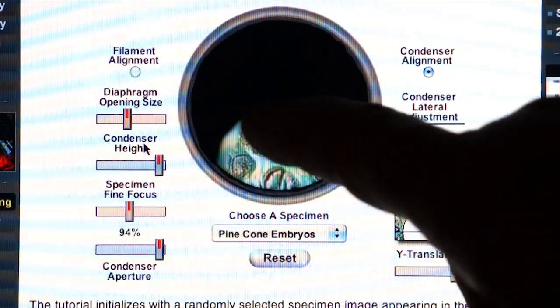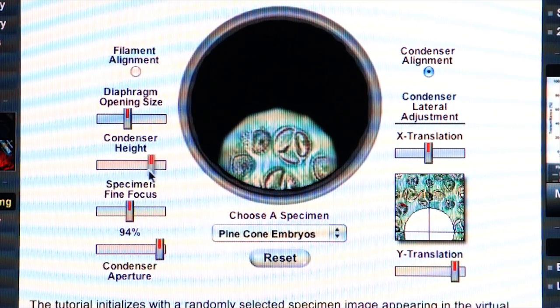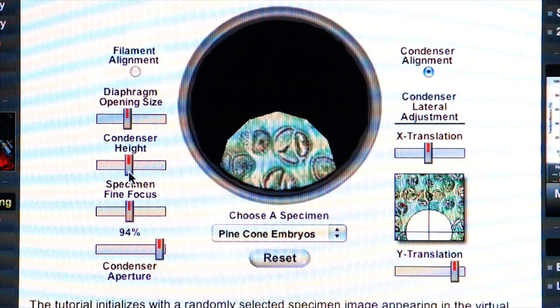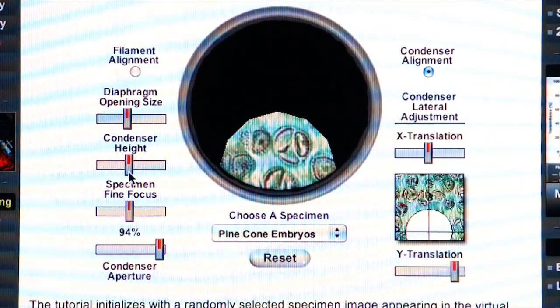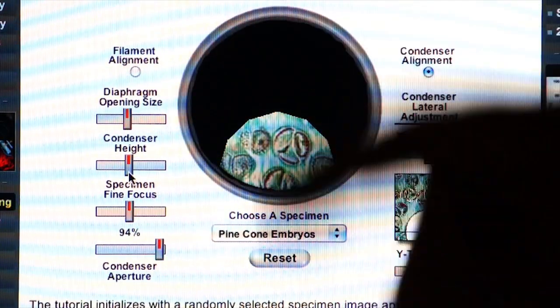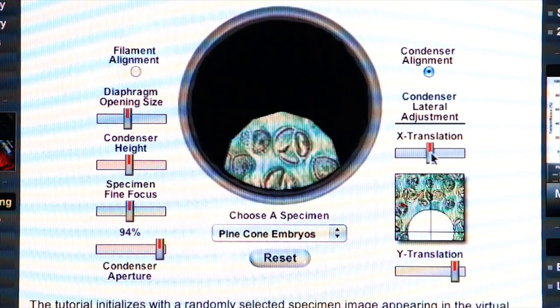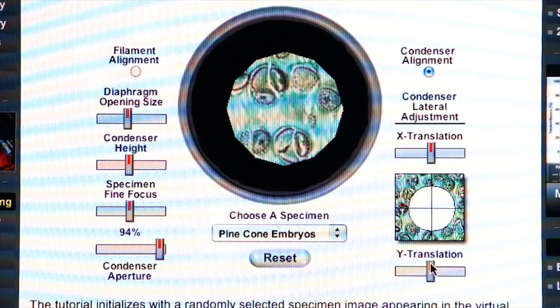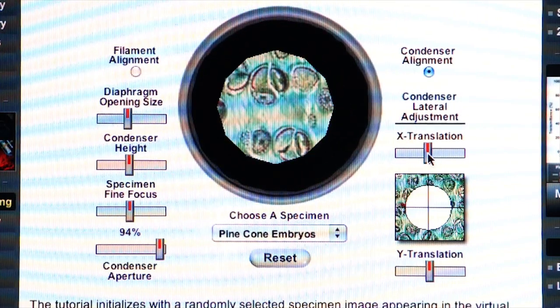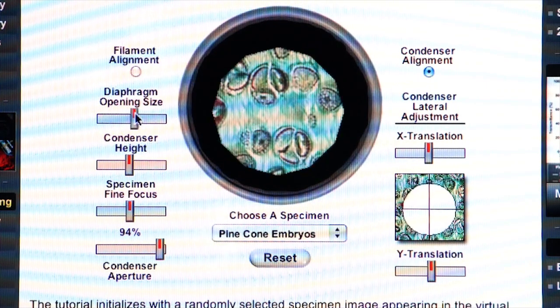It's important that the diaphragm leaves be nice and sharp. If they appear defocused, move the condenser height up and down until you get nice sharp leaves on the field diaphragm. Once the leaves are sharp, align the field diaphragm to the field of view using the alignment tools on the side of the microscope to move the condenser left and right and up and down. Then open the diaphragm to just outside the field of view.